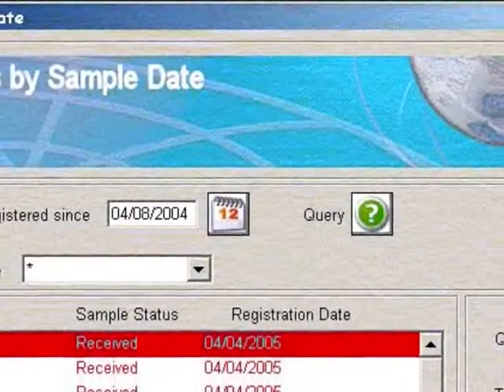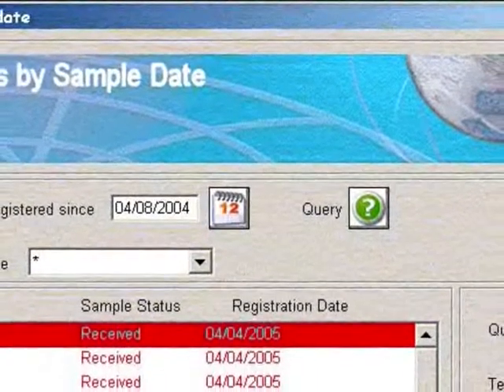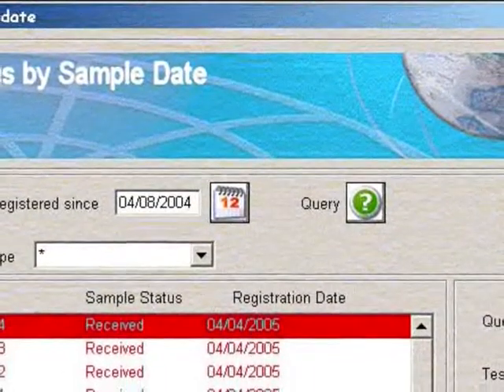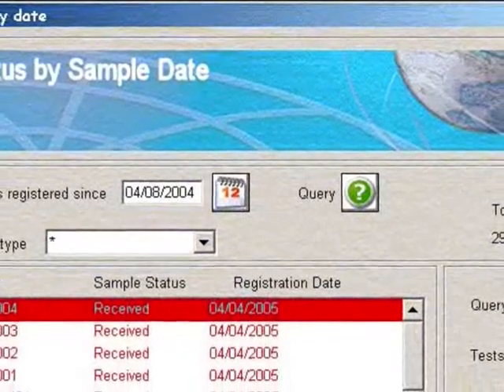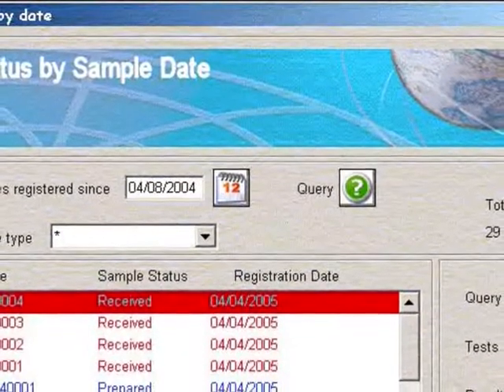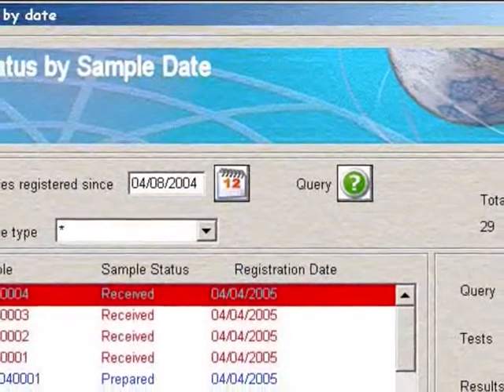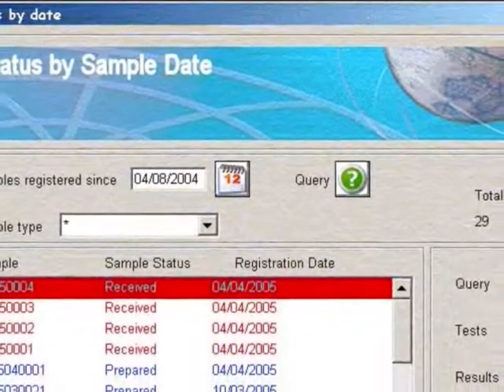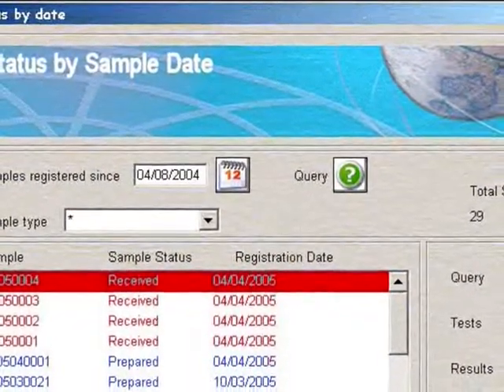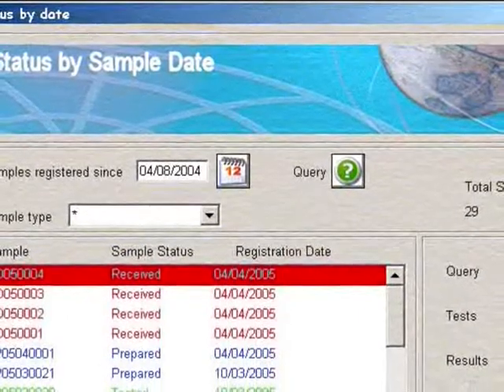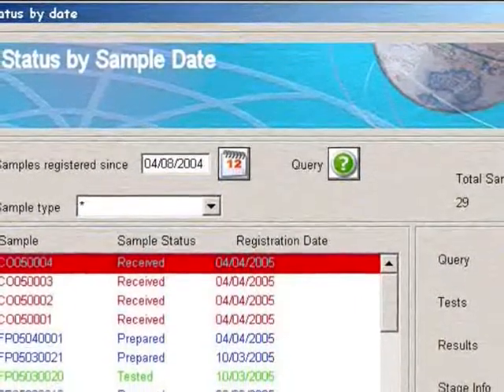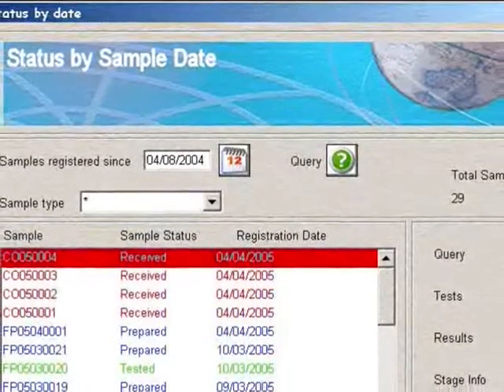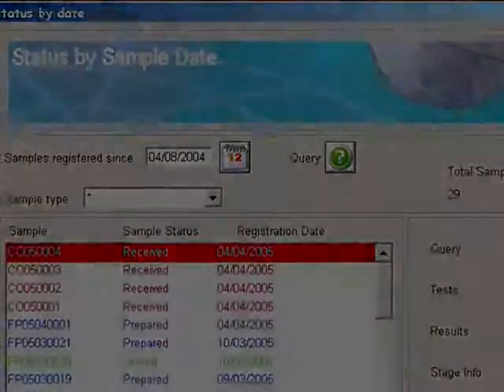The easily configured sample status screen utilizes color list boxes to delineate various sample workflow stages. Similar screens can be easily and rapidly configured to meet your own requirements.